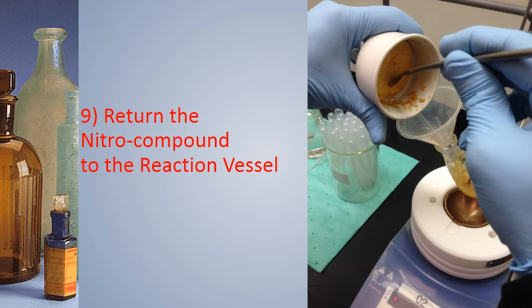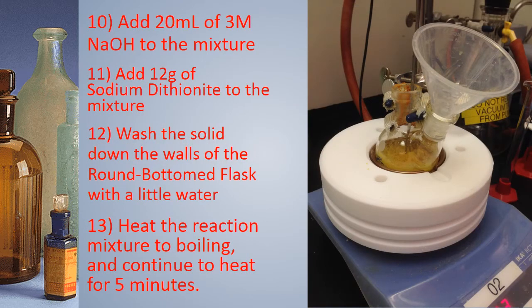We may then return the nitro compound to the reaction vessel. Add 20 milliliters of 3 molar sodium hydroxide to the mixture. Add 12 grams of sodium dithionite to the mixture. Wash the solid down the walls of the round bottom flask with some water. Heat the reaction mixture to boiling and continue to heat for 5 minutes.